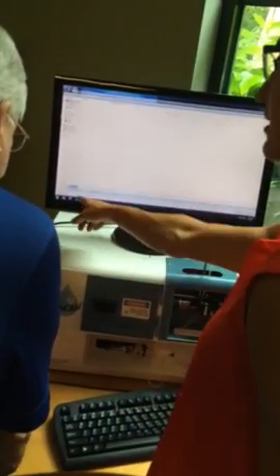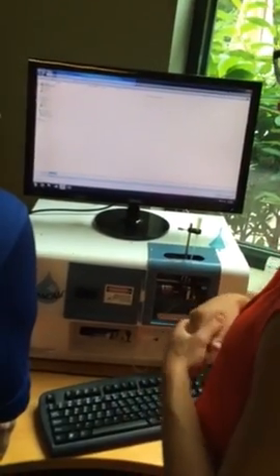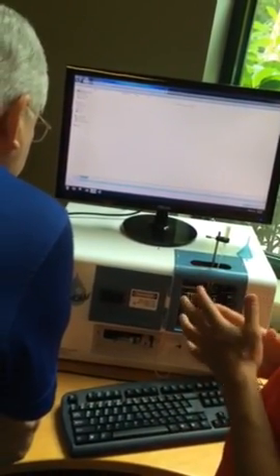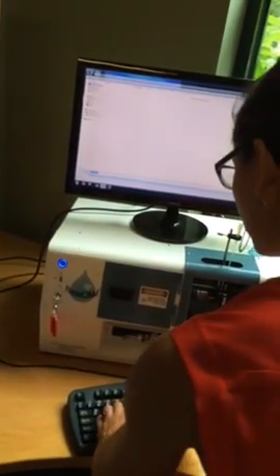So we have 4x 300 micron under the high-tech folder. And the list file, you can let it be the serial number if you want. Those are automatically generated if that's the most helpful way for you to track your data over time. I like to do everything with year, month, day, hour, minute, second.